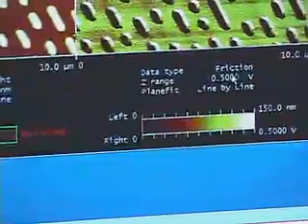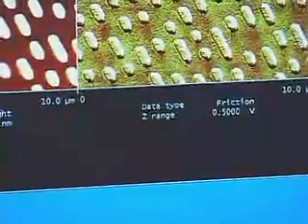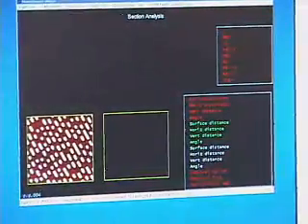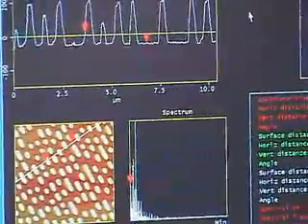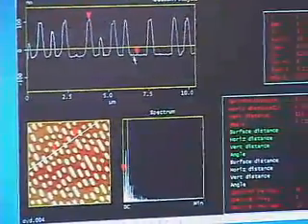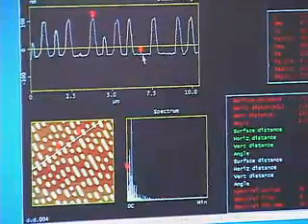If we want to look at this in more detail, we can switch over to another section of the software which allows us to look at a cross-section of that surface. I can draw a line across some of these features and we pick up a cross-section that allows us to accurately measure the height of the features. The actual exact height is about 131 nanometers.